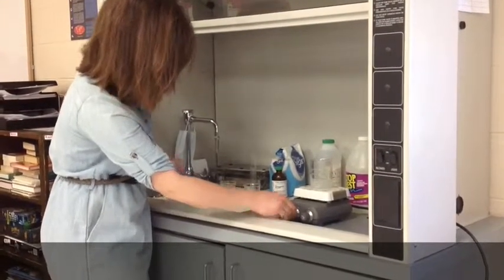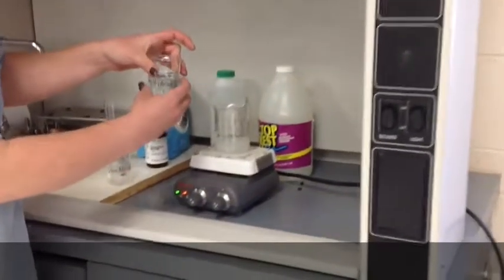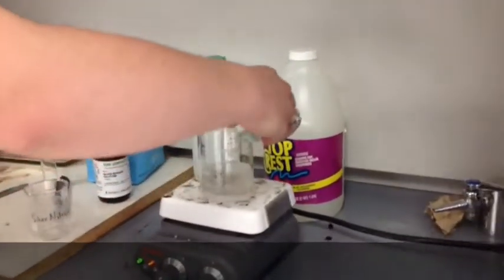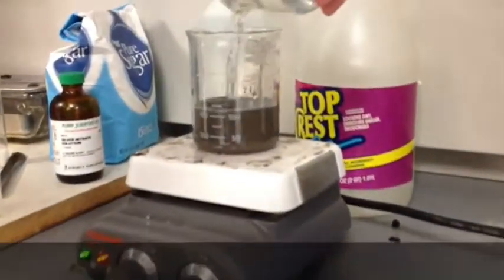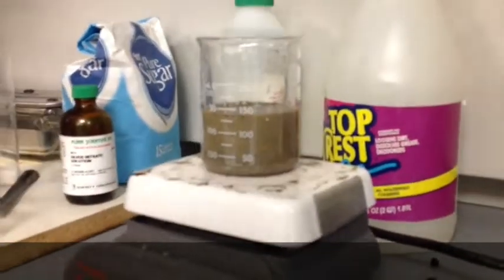Prepare to put the sodium hydroxide into the beaker as well. This will turn a brown color — that's okay, it's supposed to look like that. It's supposed to look like dirt.